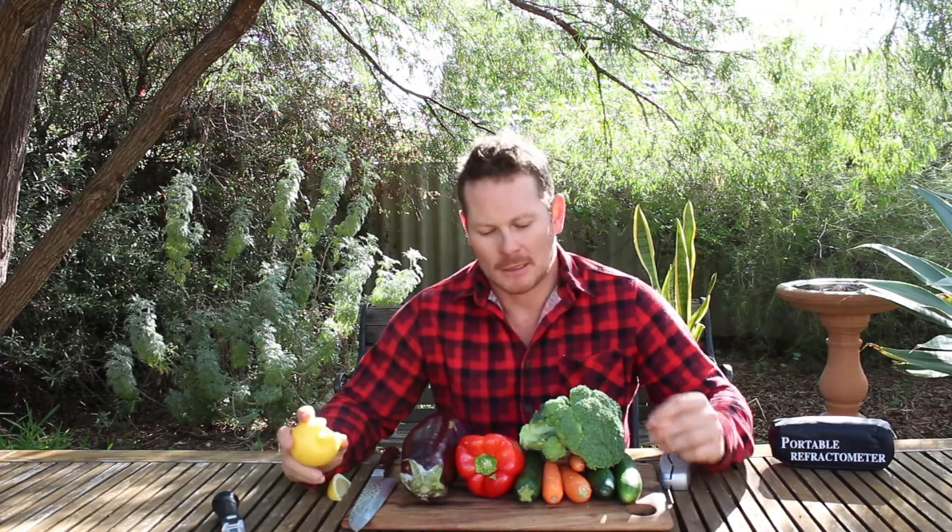So you're growing all your food at home and everything's growing really well — you're generating a lot of produce. But how do you know if it's good quality produce? How do you know if what you're growing is packed full of vitamins and minerals? This is where the Brix refractometer can help.